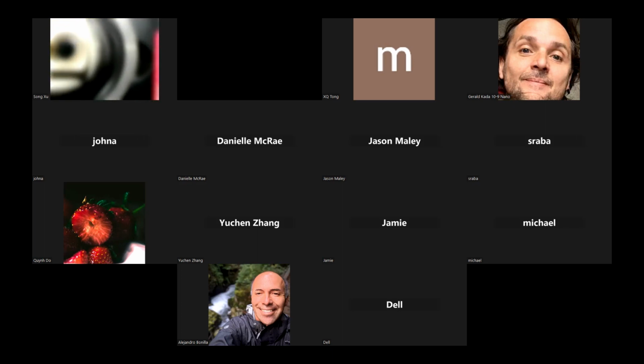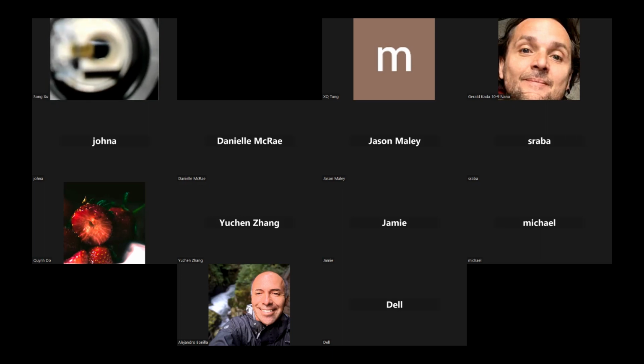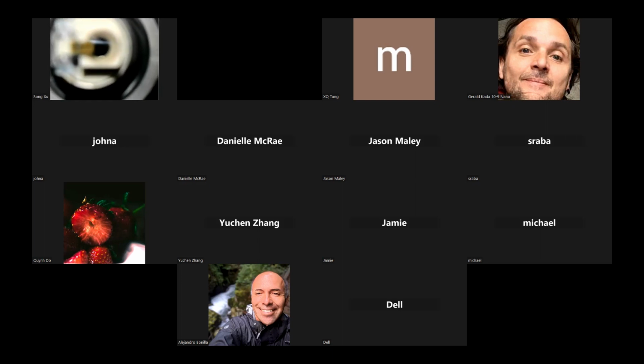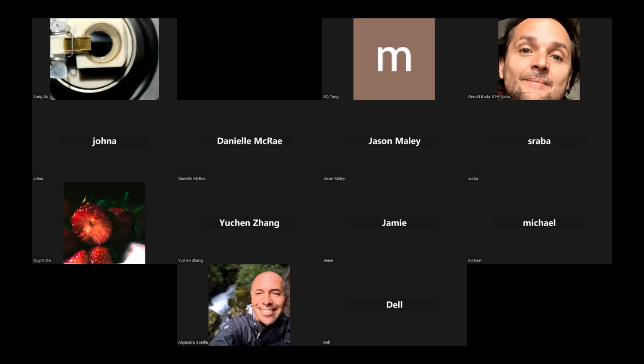I'm trying to show you this, but it became blurry now. I don't know. Probably the background. So yes, when you do STM, the biggest enemy you're fighting is drift. There you go. It's coming.